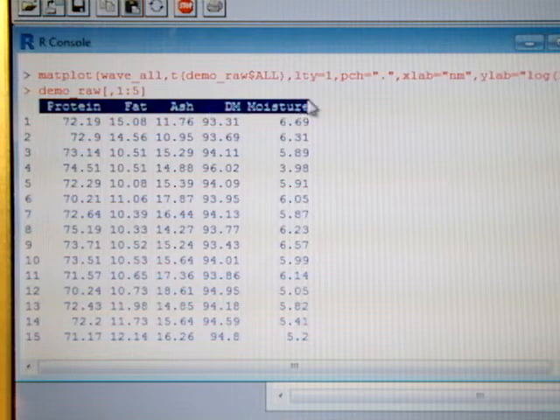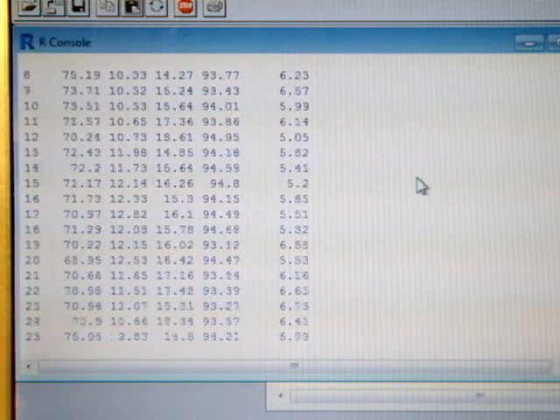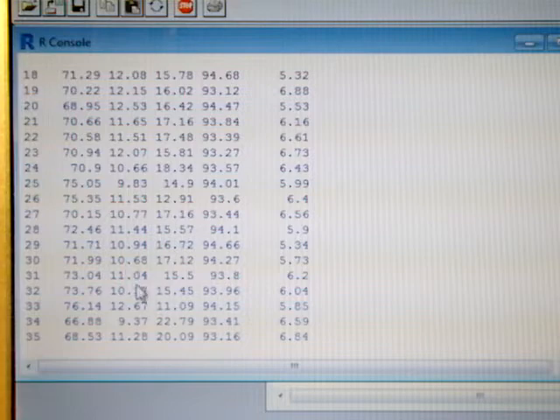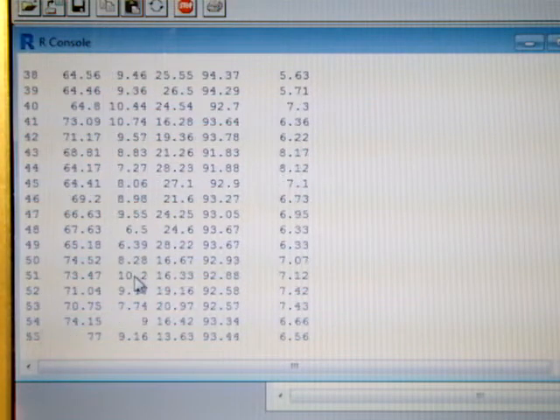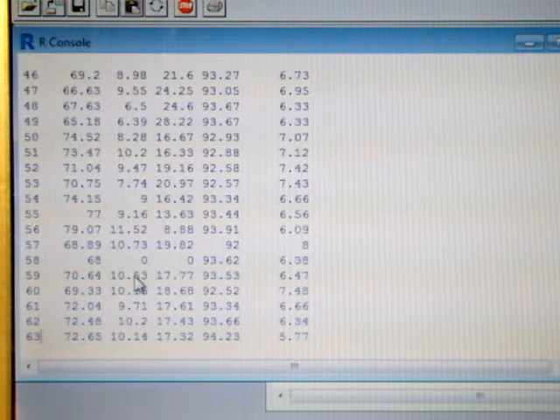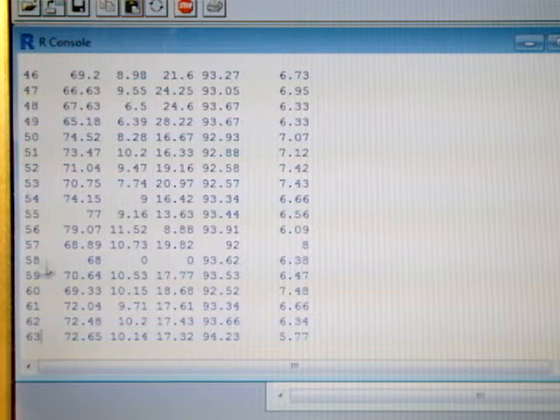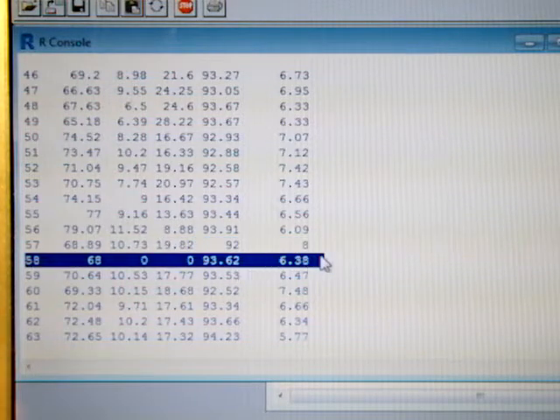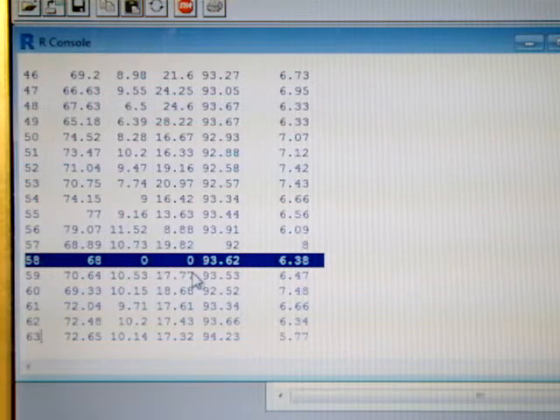And if we look more carefully, these are the values in percentage. We see that for example sample 58, we have 0 values for fat and ash.